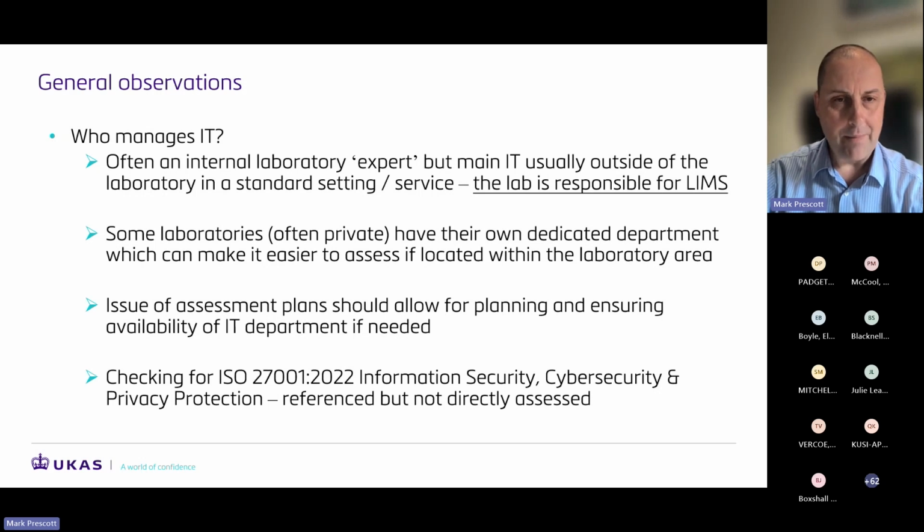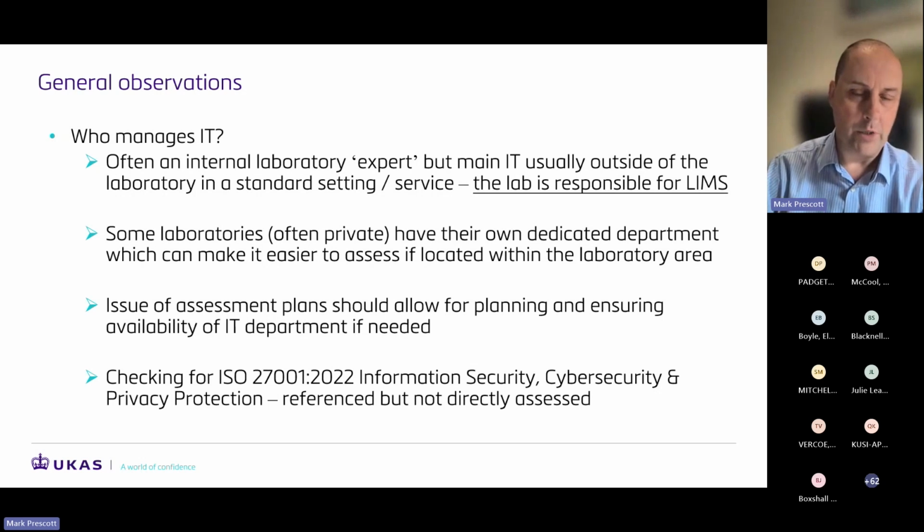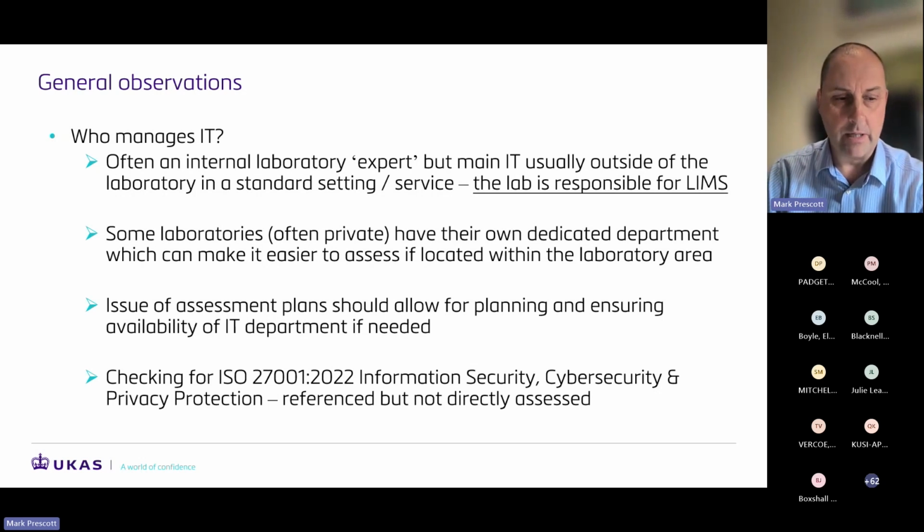Now, it's worth bearing in mind, we're not assessing to ISO 27001 when we do our 15189 assessments, but the eagle-eyed might have seen that it is directly referenced in the 2022 standard, just saying that some of the principles may be useful, and there's extra information within ISO 27001.